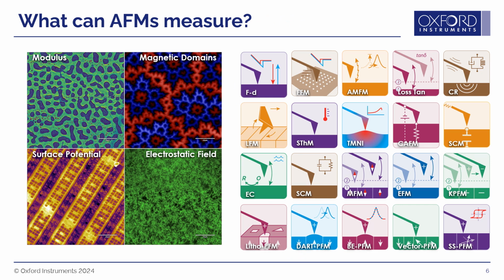Indeed, AFM can characterize many different types of samples by measuring mechanical properties, including Young's modulus, adhesion, viscoelasticity, and friction, thermal properties, including thermal conductivity, as well as observing thermal phase transitions, electrical properties, including conductivity, capacitance, magnetic and electrostatic force gradients, surface potential and work functions, as well as piezoelectric response. AFM can be run in these different operational modes with different probes and in different environmental conditions. Frankly, this wide breadth of capabilities is one of the things that can make AFM a little bit intimidating.